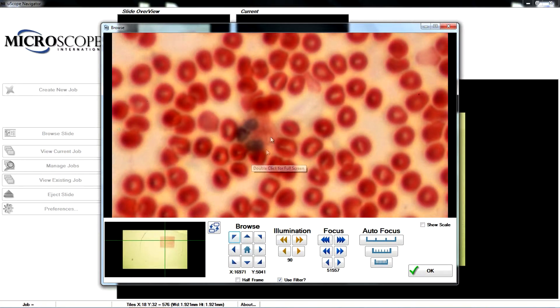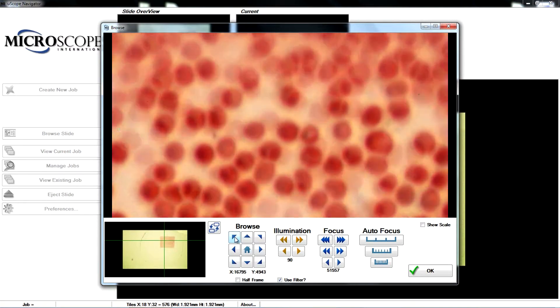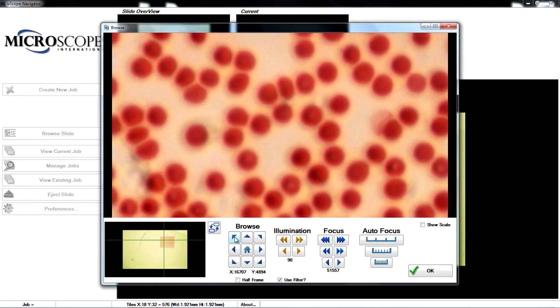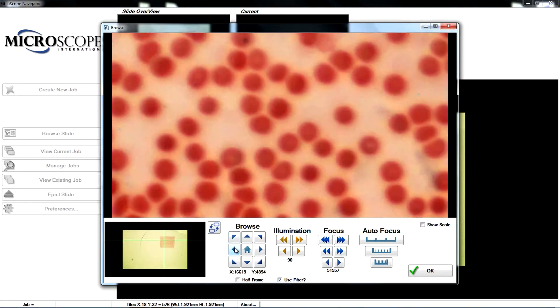In this blood smear, we have a white blood cell. We can browse around the slide to find other white blood cells.